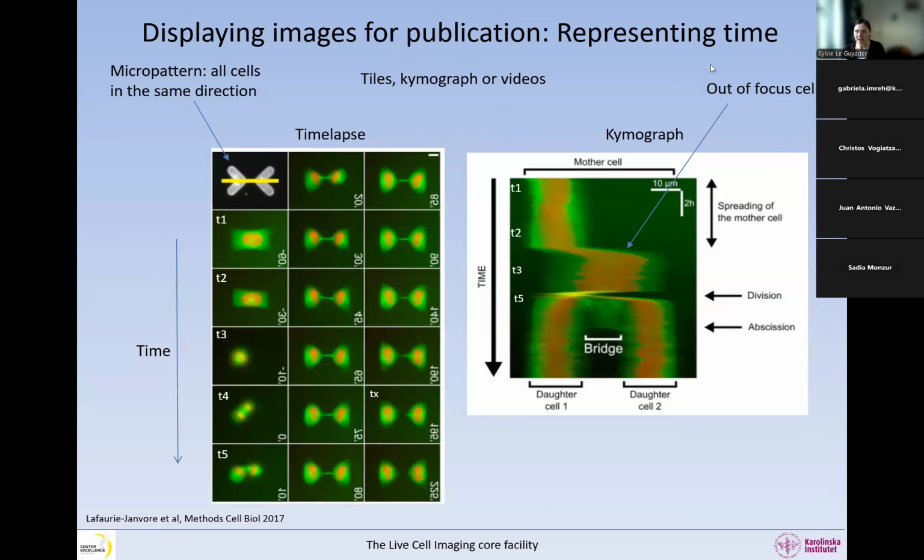When we want to represent time, we have the possibility to put all the tiles of a time lapse like this. We can also use a kymograph, which I will show you now, or you can use videos, but videos cannot be inserted in the printed figures. Basically, they have to be in the supplementary material, which is fine.